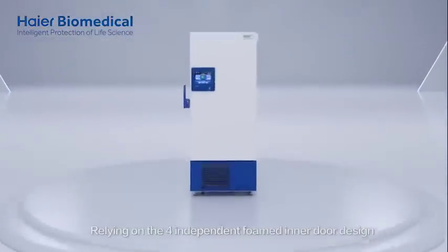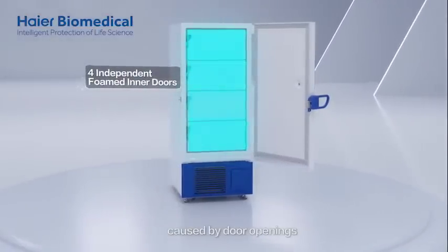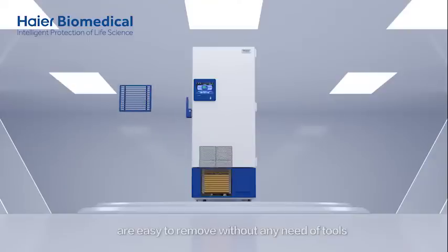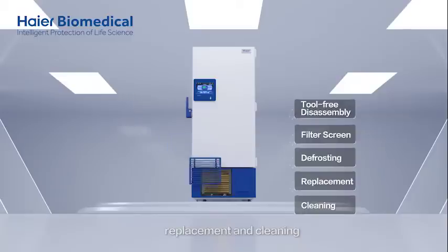Relying on a 4-independent foamed inner door design, the freezer can effectively reduce cold energy outflow caused by door openings. Its inner doors and filter screens are easy to remove without any tools, facilitating quick defrosting, replacement and cleaning.